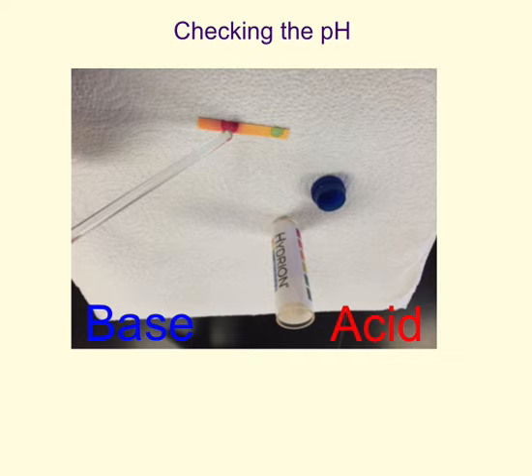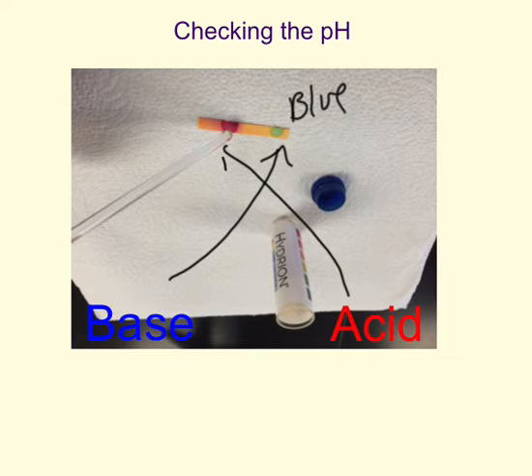All right, upside down picture, here we go. This is completely off. This is our base, which is blue, and this is our acid, which is red. Okay, so that's the acid.